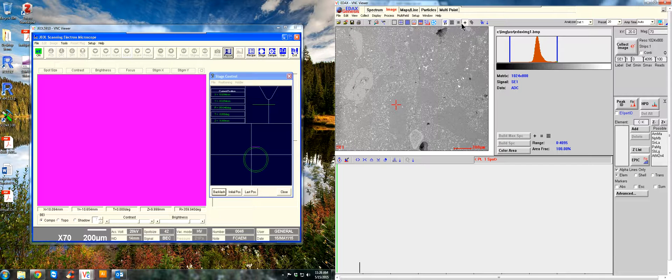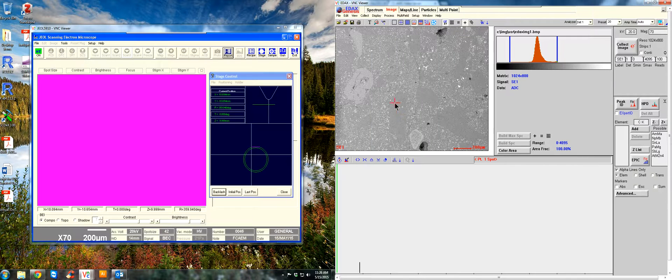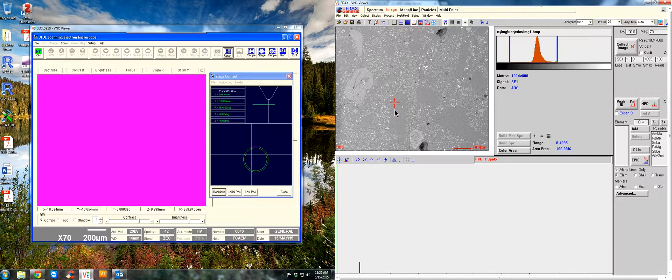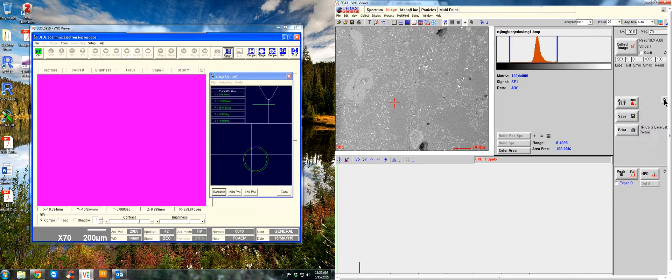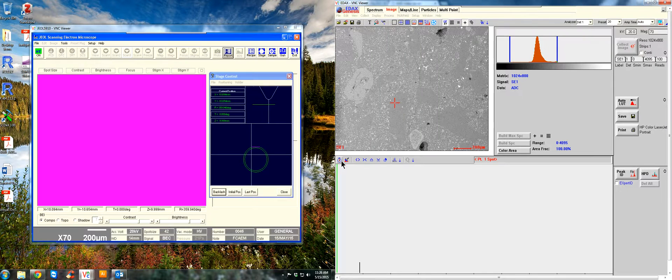So let's say we want to analyze this phase right here. We would click the crosshairs button in this option right here, and then click on anywhere on the phase. We would hit this disk button and it will begin collecting.